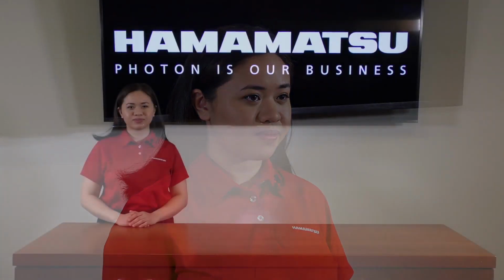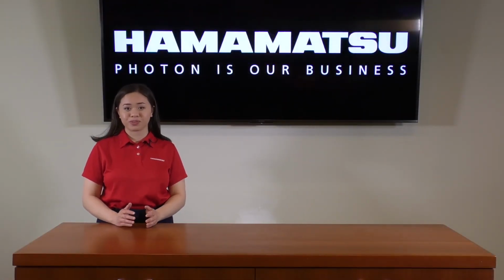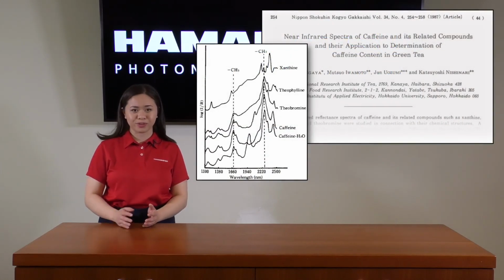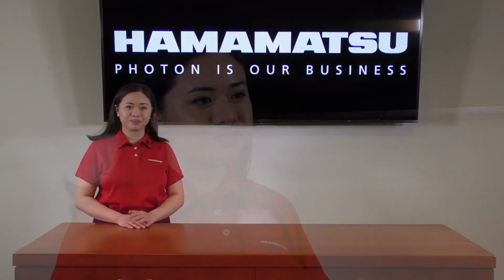It's also important to know the granularity you'll need to resolve different peaks and the integration time required to detect a signal from the sample. The sample we're studying today is theophylline, which has known peaks from 1600 to 2100 nanometers, or for those who speak in wave numbers, 6200 to 4700 wave number respectively. Choosing a spectrometer to study this sample and other samples can come down to the spectra obtained. But why are these spectra so important to pharmaceutics?